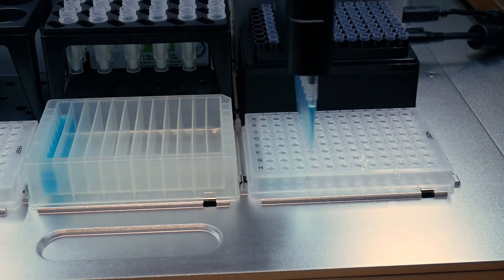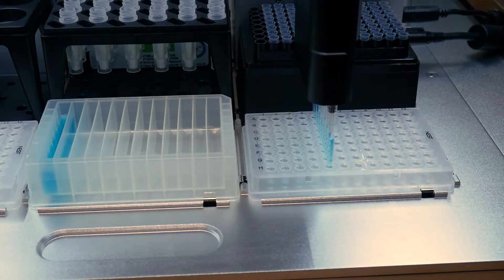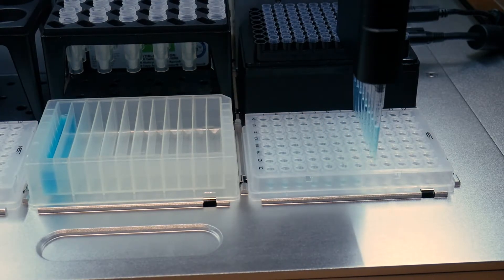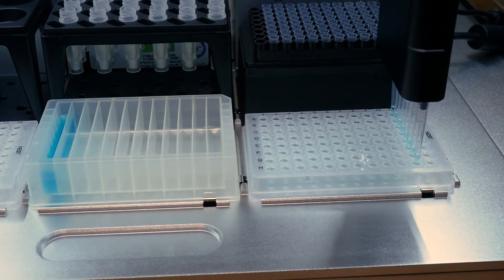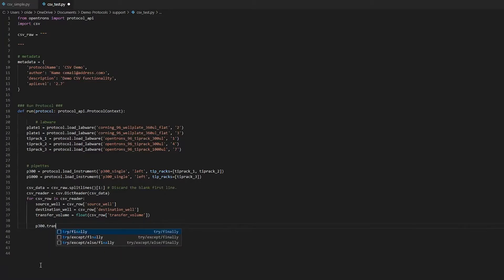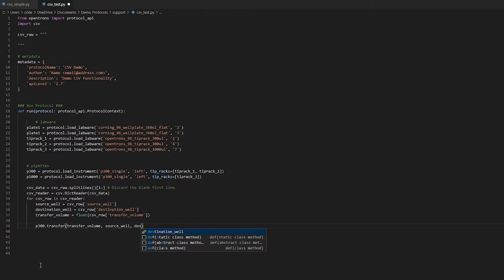The OT-2 is also a terrific multitasker. It can do multi-dispensing to distribute a volume into multiple wells. It can multi-aspirate, picking up from multiple wells and dispensing it all into a single well or tube. If you're doing serial dilutions, cherry picking, or plate filling you can incorporate a CSV file. If you're comfortable with the Python scripting language you can build the CSV directly into your protocol code, or if not, our application engineering team is always available to help. In fact, your robot can be programmed to do just about anything that you can do by hand — and some things that you can't, like pipetting at a wide range of different flow rates.